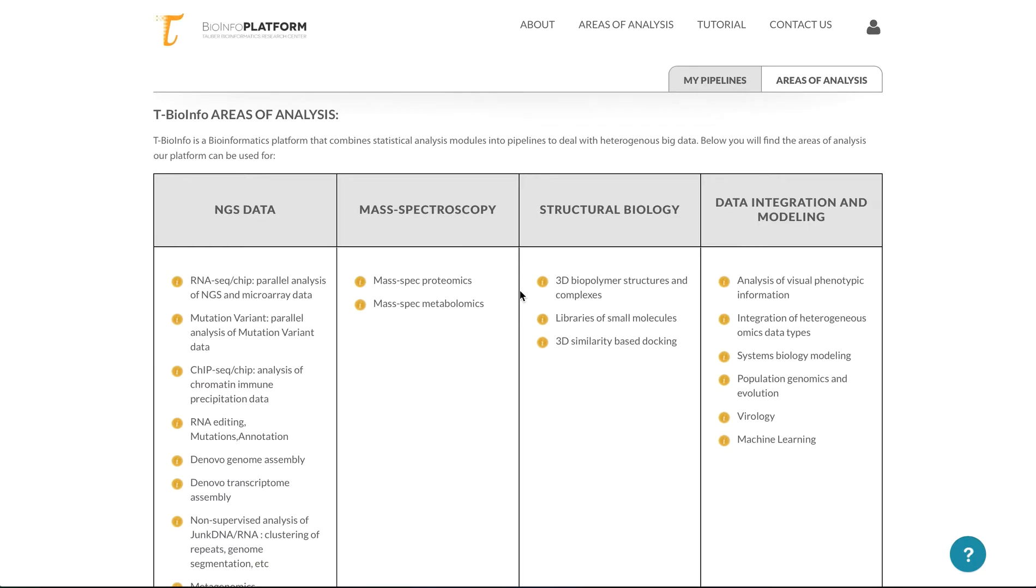T-BioInfo is a platform that covers many different areas of analysis, many different data types, and this is what you see when you first log on to the T-BioInfo platform.